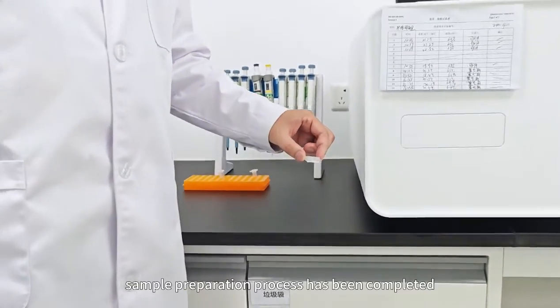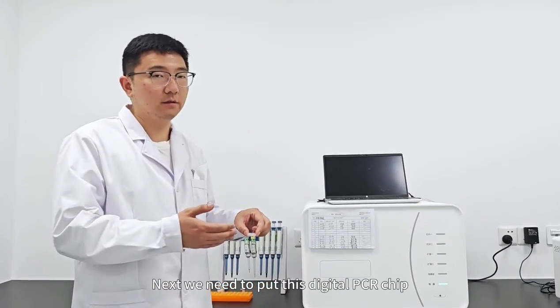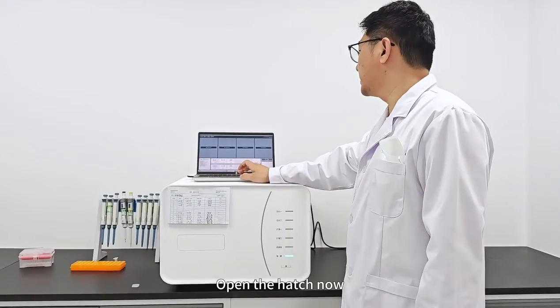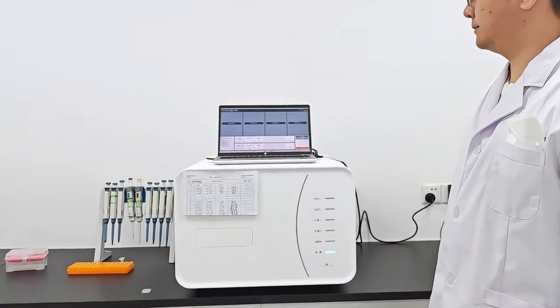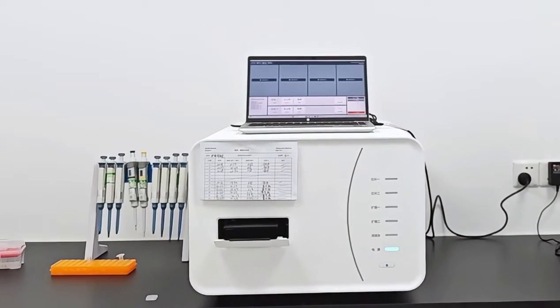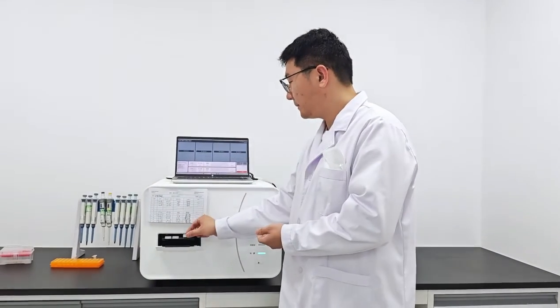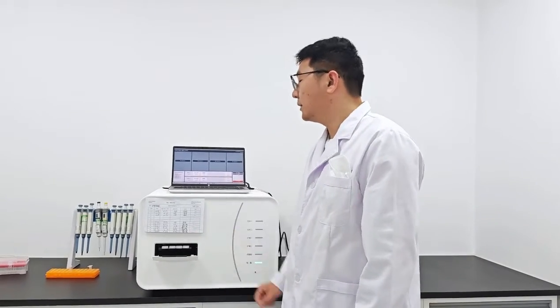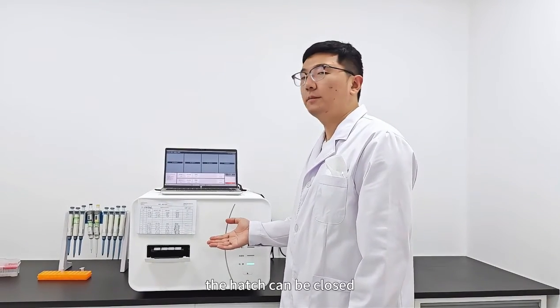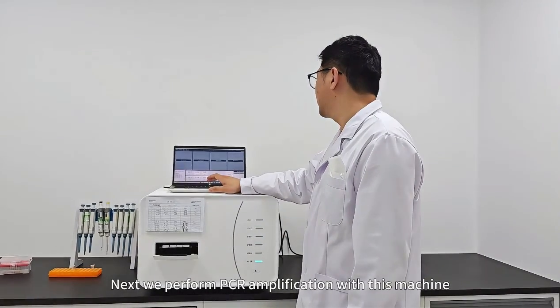Now, our entire sample preparation process has been completed. Next, we need to put this digital PCR chip into our digital PCR all-in-one machine for amplification and analysis. Open the hatch now. After placing this chip, the hatch can be closed. Next, we perform PCR amplification with this machine.